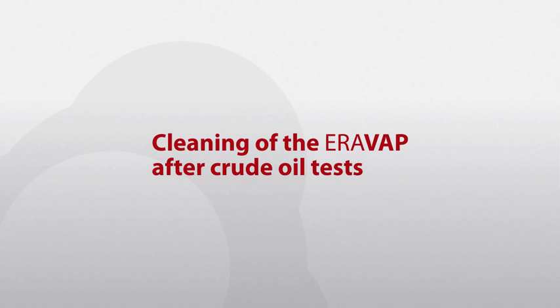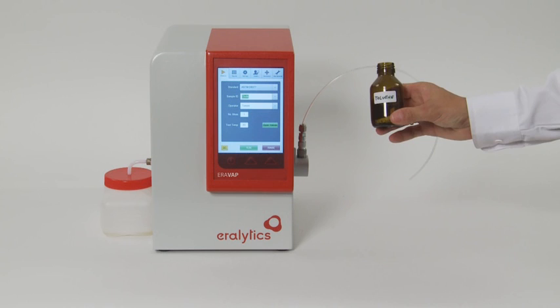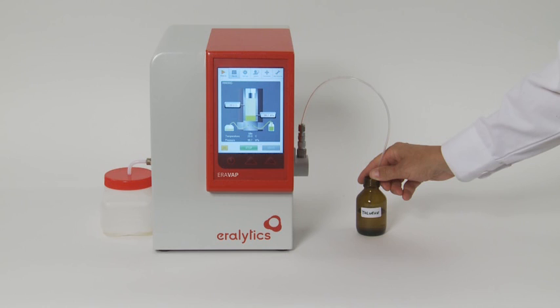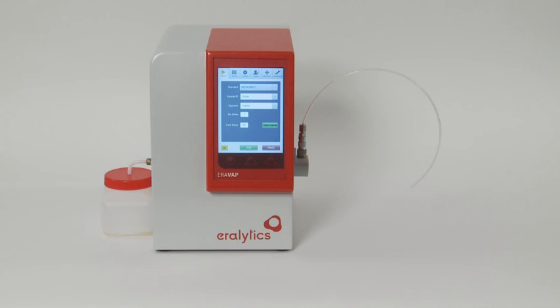Cleaning of the AeroVap after crude oil tests. Measuring crude oil requires a good cleaning procedure to avoid any residues remaining in the measuring chamber. Use toluene for cleaning. Clean the instrument immediately after the test measurement. Press the rinse button to start 5 automatic cleaning cycles. Carefully observe the outlet to see whether the toluene is still dark after the last rinsing cycle — if so, press the rinse button again. After the cleaning with toluene, another rinsing process must be carried out with air. Then the instrument is ready for the next measurement.